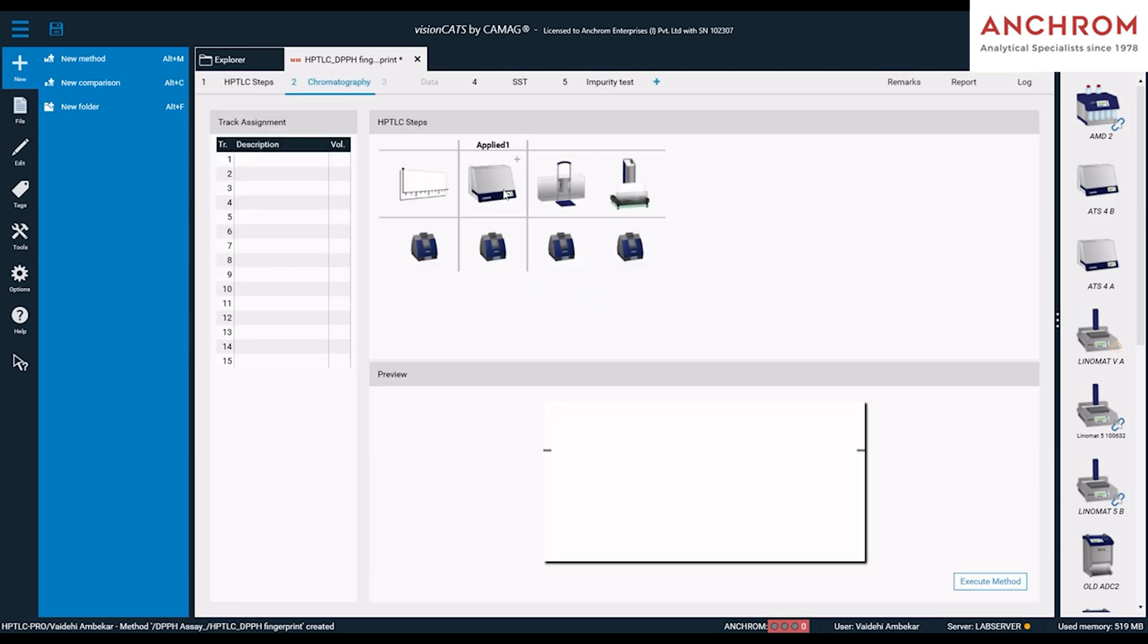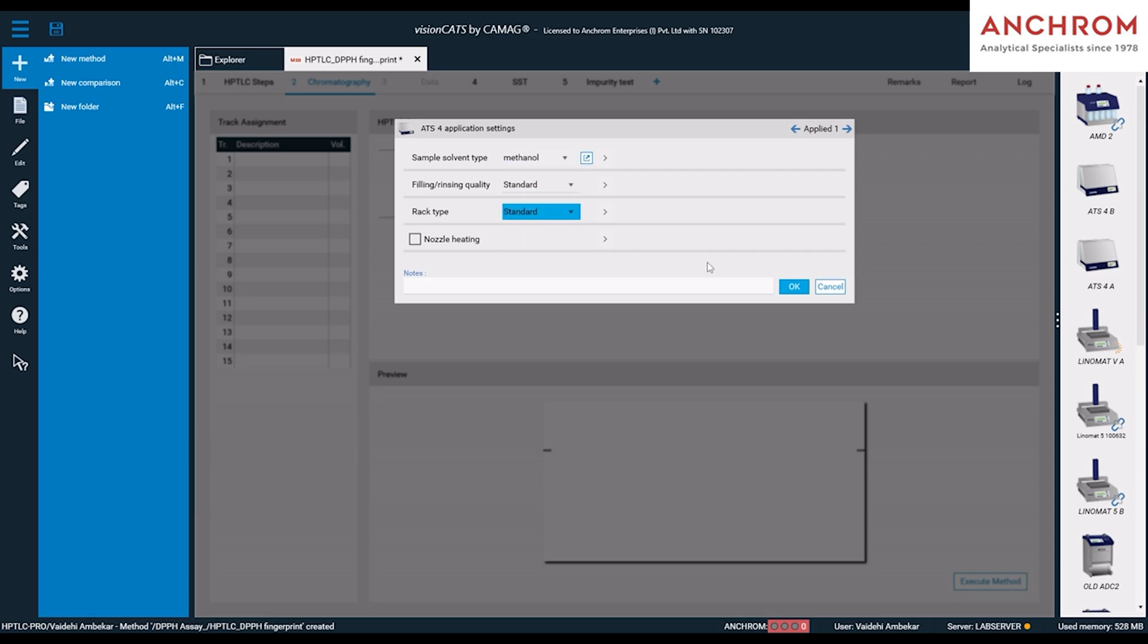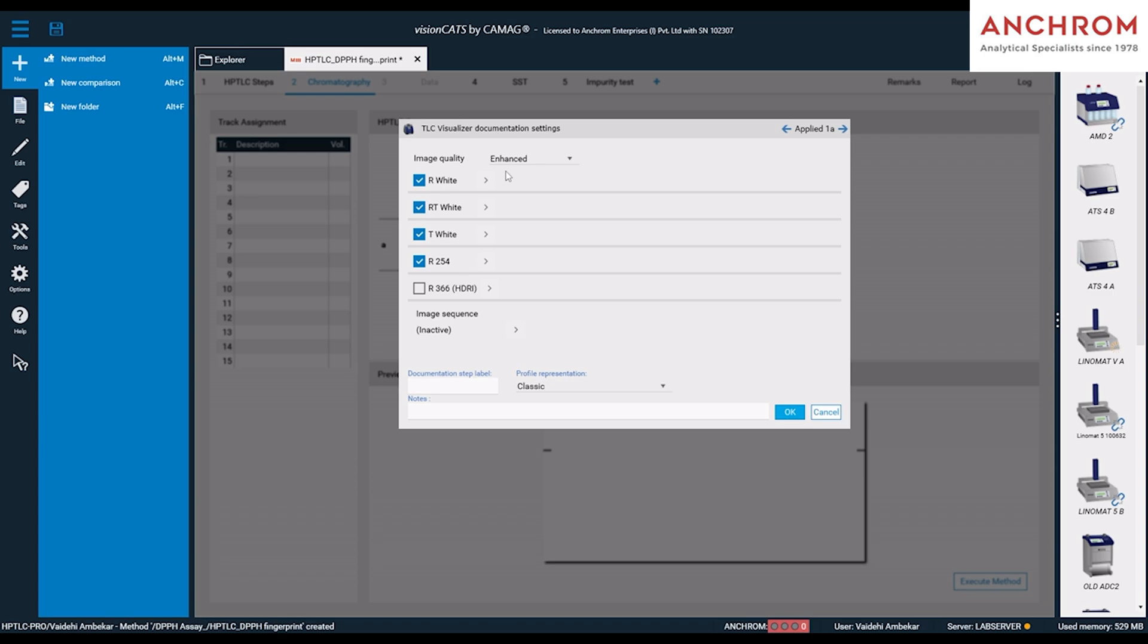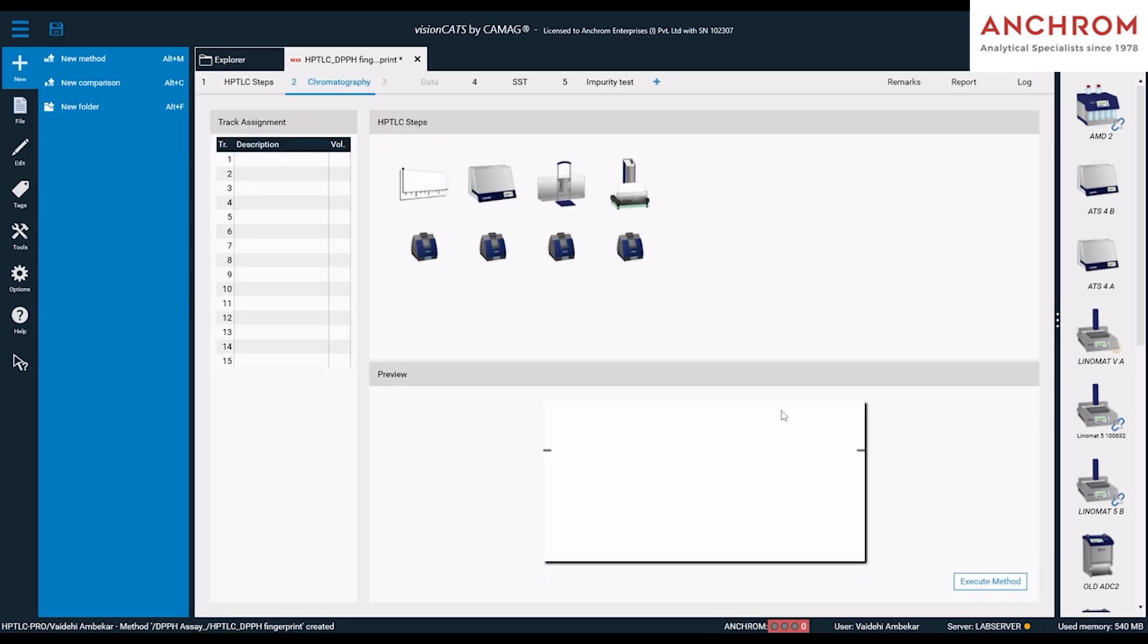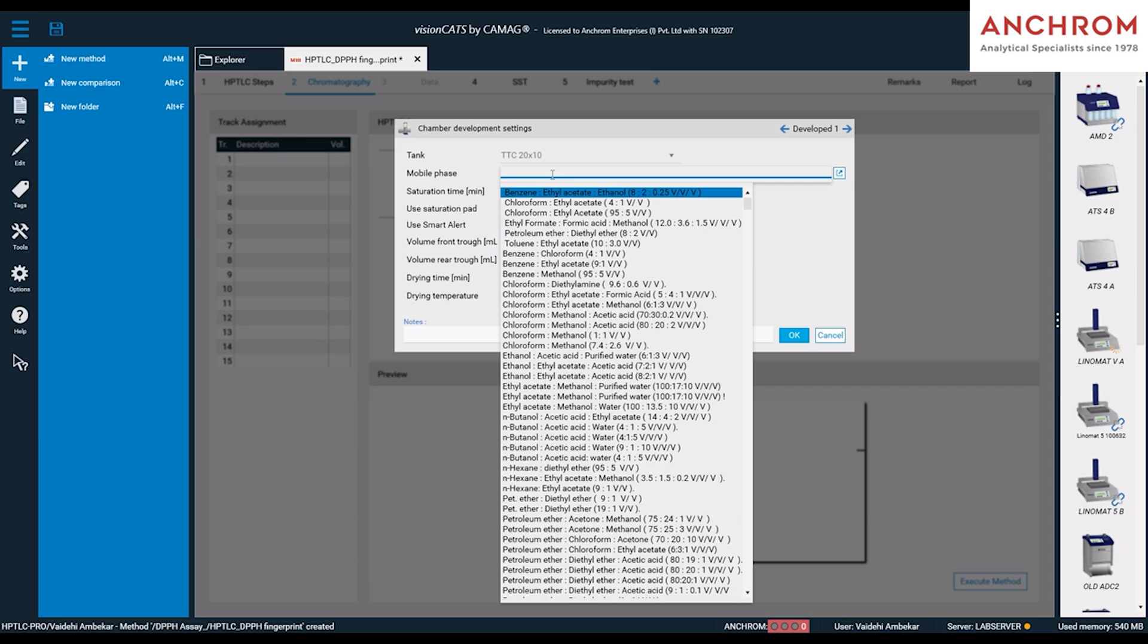Next, click on the ATS4 icon and fill the details as shown. Next, click on the Visualizer 2 icon and select the illuminations in which you need to capture the applied plate image. Then, click on TTC chamber and fill in the selected mobile phase as shown.